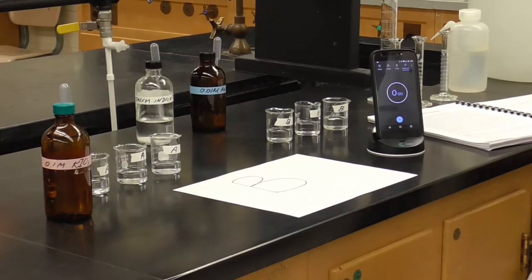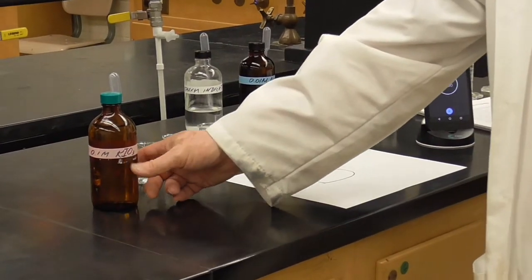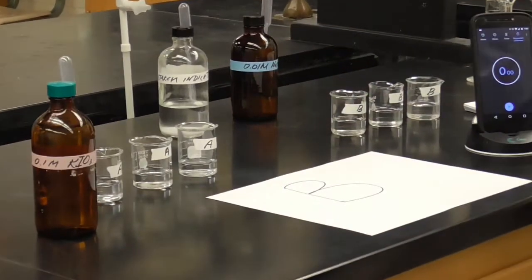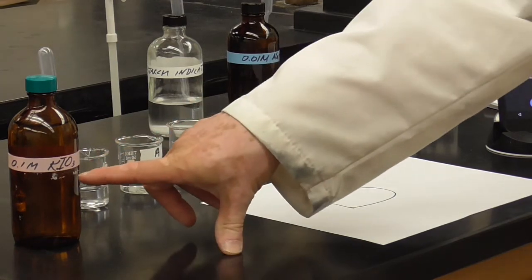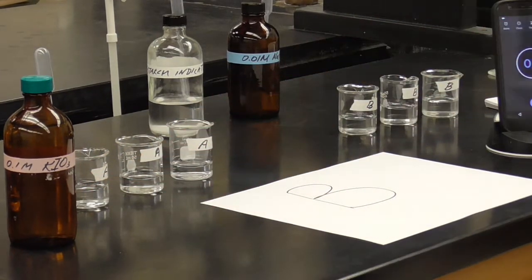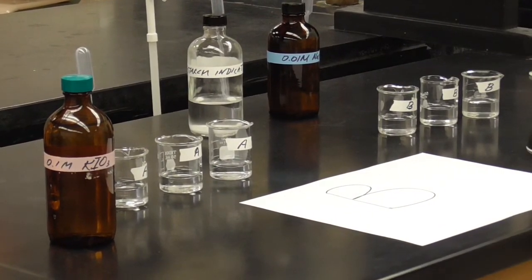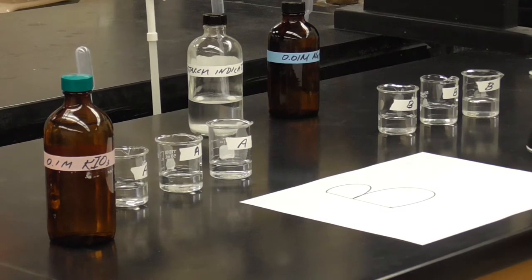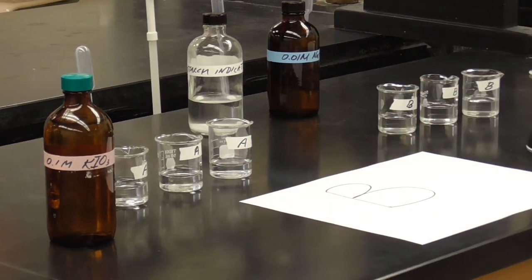In beaker A, looking at the chart in your lab manual, that should have both water and different amounts of the potassium iodate. I've already put the water in, again, just to save some time, but we need to add the potassium iodate. That's the one that we're going to change the concentration of. And if you look on the table in your manual, the first beaker will only get 2 milliliters of the iodate, the second one gets 4, and the third one gets 6. So quite clearly, the concentration is going to be increasing from 1 to 2 to 3.